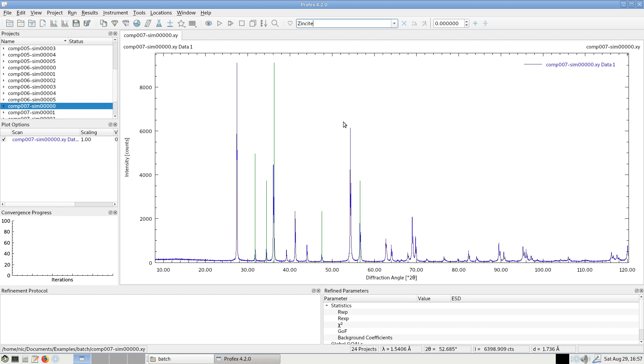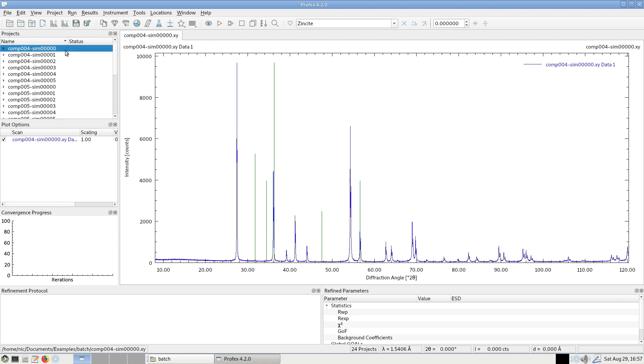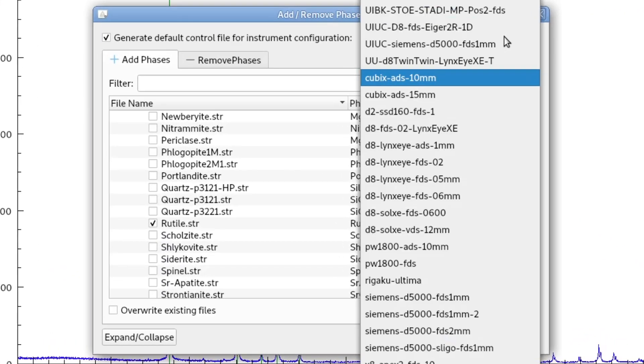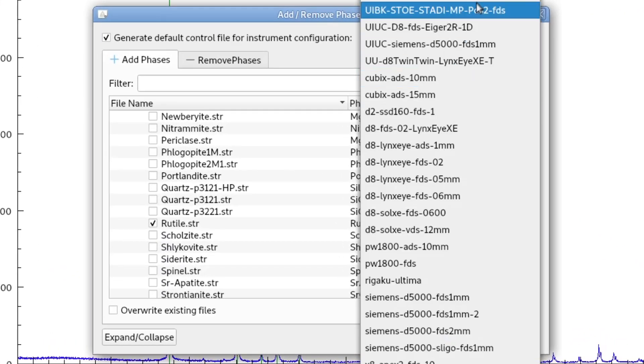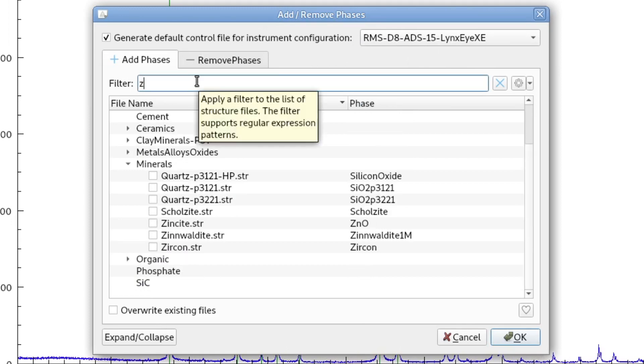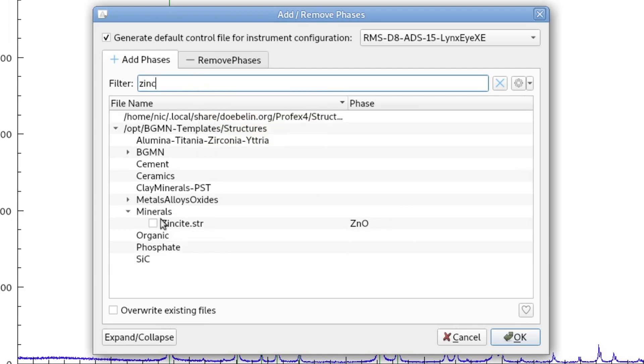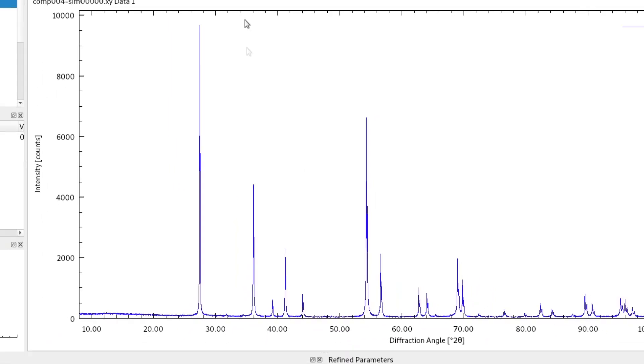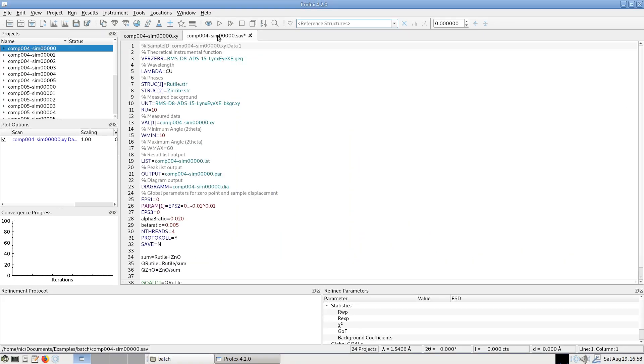I will start the processing of these files by creating a refinement project for the first dataset. As usual, I select my phases here and I click the add remove phase button. I select my instrument, which was the RMS D8 ADS instrument. And I have rutile already selected and zincite. So now I get my refinement control file with the two phases and I can immediately start a refinement.